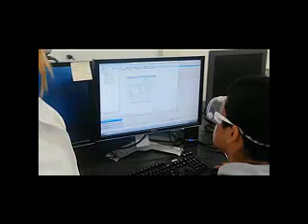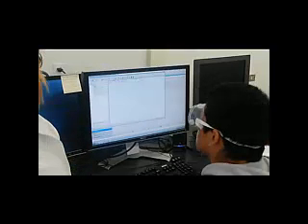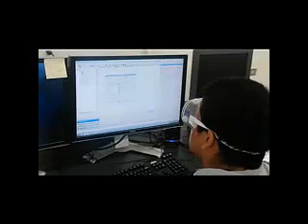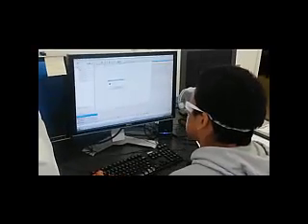What's the thing? Why is this delete? Is it supposed to be delete? I'm deleting them with you. Oh, okay. We'll do that.